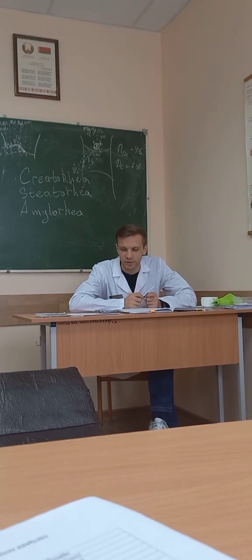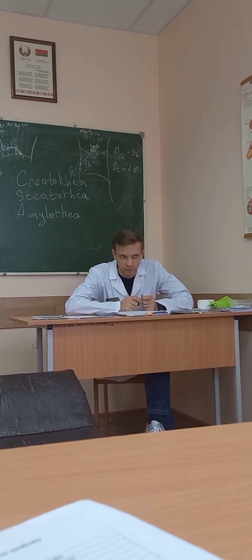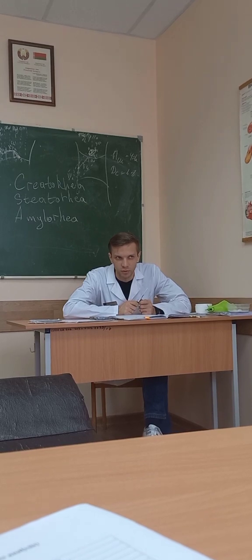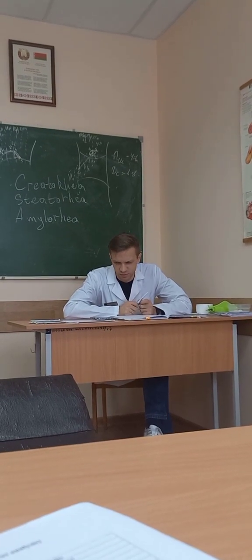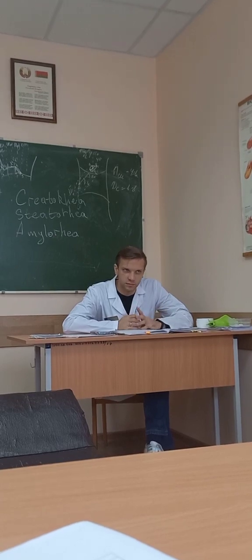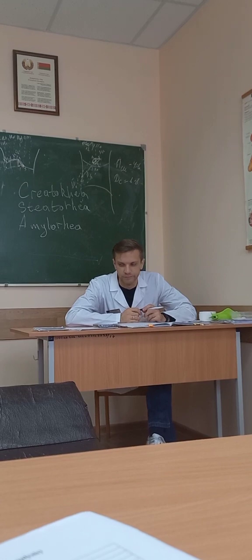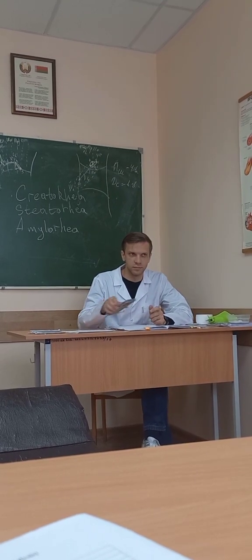What is in the microscope? Leukocytes are present, and mucus is present. It's 1 to 2 in sight, not too much. If it would be bigger, it would be colitis, but now we can conclude enteritis. If the mucous epithelium is at a high level, that is colitis. Low level means enteritis.